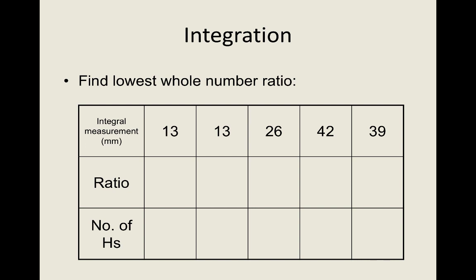We start the calculation by tabulating the height measurements. The rest of the calculation is the same as before. Find the lowest value and divide through by this. Then decide whether to round or multiply the values. You'll notice we get the same answer as before.